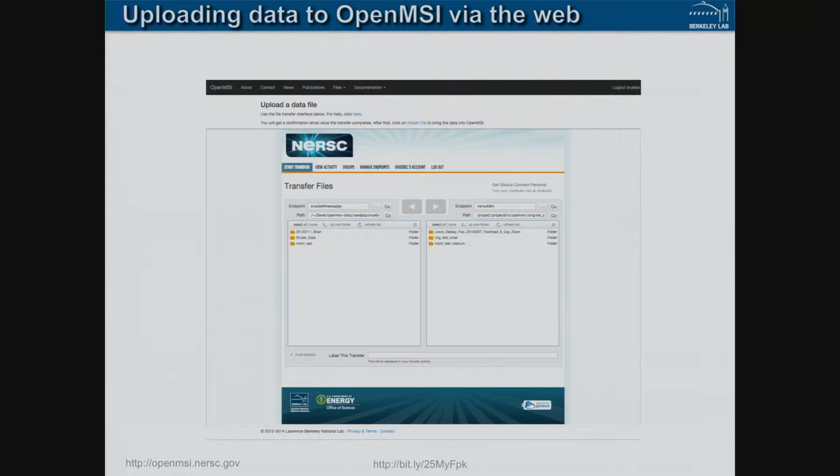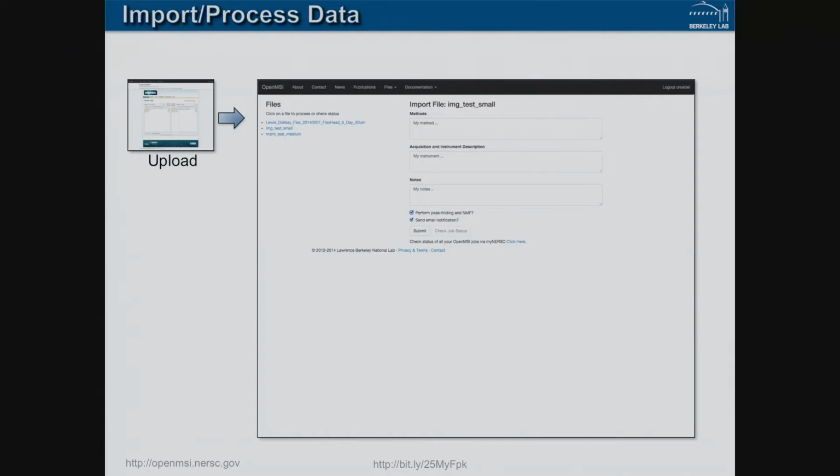Getting data to go from a group in some random lab to a supercomputing center is harder than you think. You'd think you would just get some off-the-shelf widget, plug it into your website, and be good to go. That was not the case, partly because the files were so large. We were using a service called Globus to transfer the files, and it was very difficult to communicate that to the users.